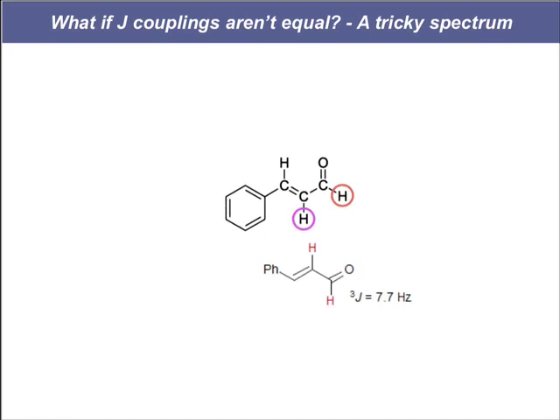We can look up on our slide and we can find that relationship, an aldehyde hydrogen next to an sp2 alkene hydrogen, those neighbors are 7.7 hertz. So that's going to be, let's say, around a 7.5 hertz doublet. So we've got two doublets. We've got a wide 15 hertz and we've got a slightly wide 7.5 hertz doublet.